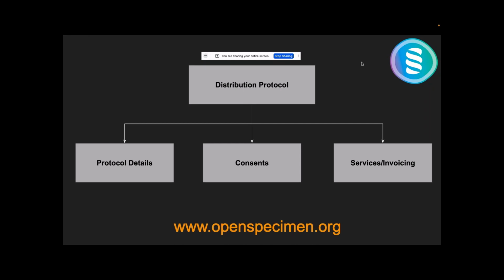We'll see a quick demo shortly of how this is done. The second part is about checking consents. In case you are documenting consents in OpenSpecimen, the patient must have consented yes before you distribute the specimen. In case one or the other participant has said no or has revoked the consent, then you won't be able to distribute those specimens.